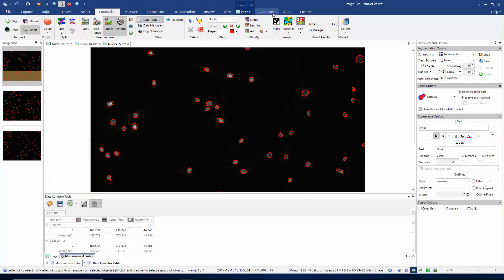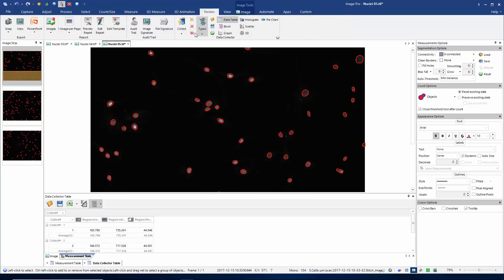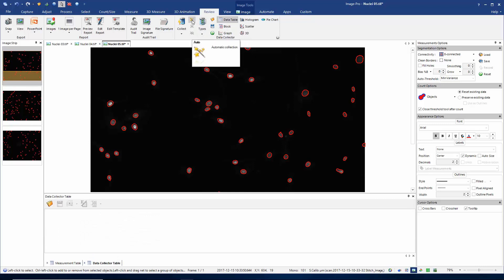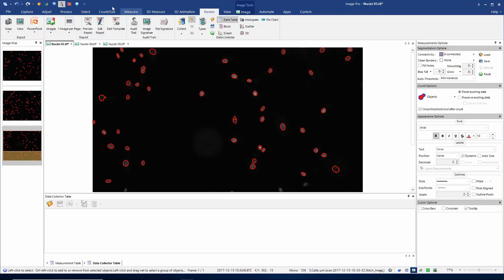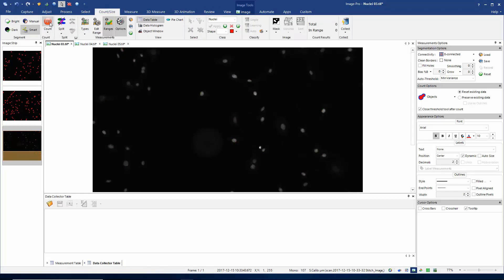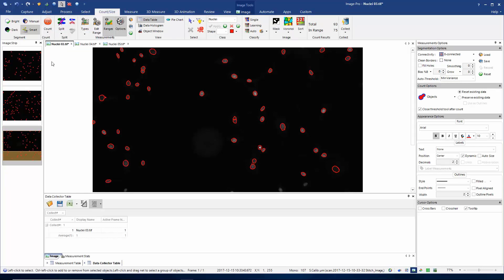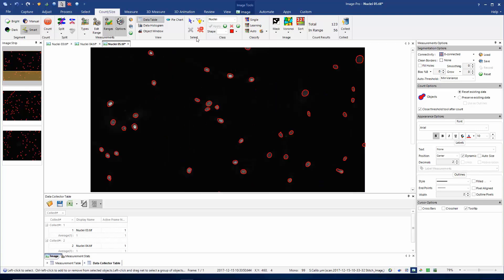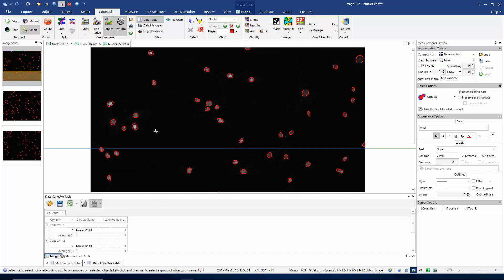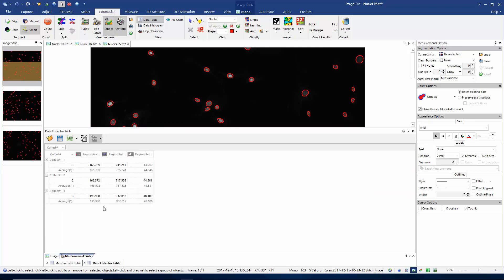There's one more thing I'd like to show you: how to use the automated option on the data collector. Let's return to the review tab, remove everything from the data collector, and switch on automatic collection. Now if I go back to my first image in the count size tab, I'll clear the objects and recount. You'll notice that without me having to select the collect button, I've made a collection in the data collector. Going to the second image, clearing measurements and recounting again makes an automated data collection. Finally on the third image I repeat my count, and I've now got three data collections and three sets of measurement statistics.